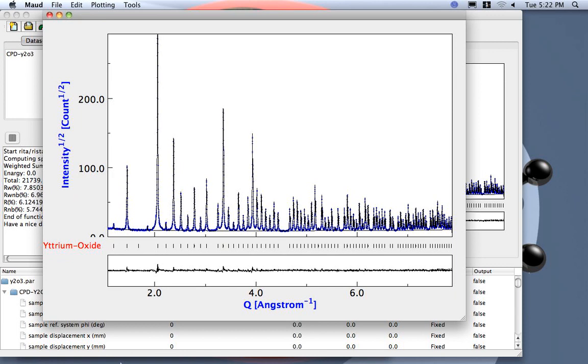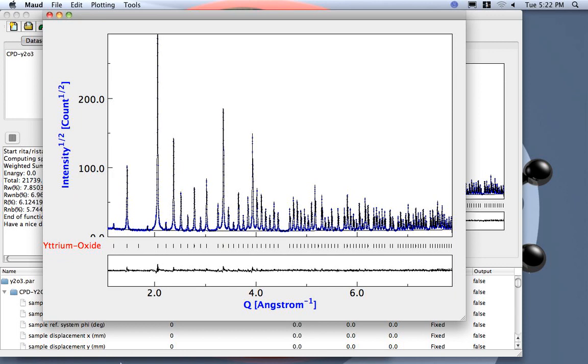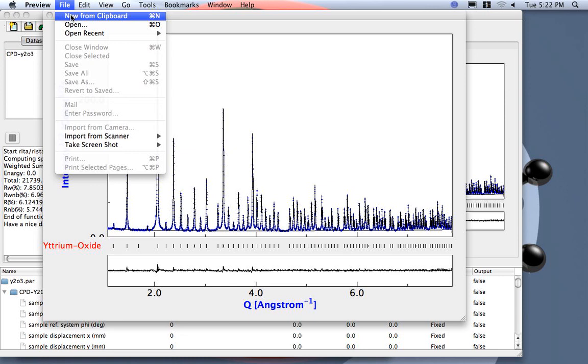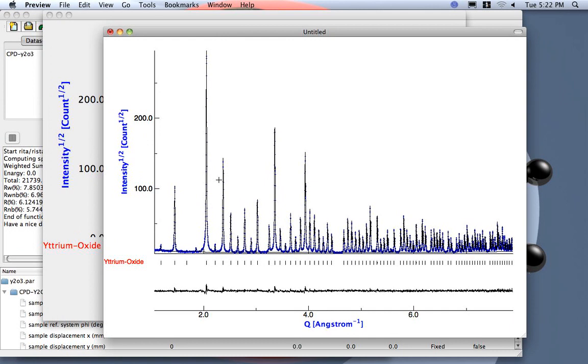Now if I do a copy paste and I paste like before, because I changed the characteristics of the plot without redrawing, it doesn't paste correctly.